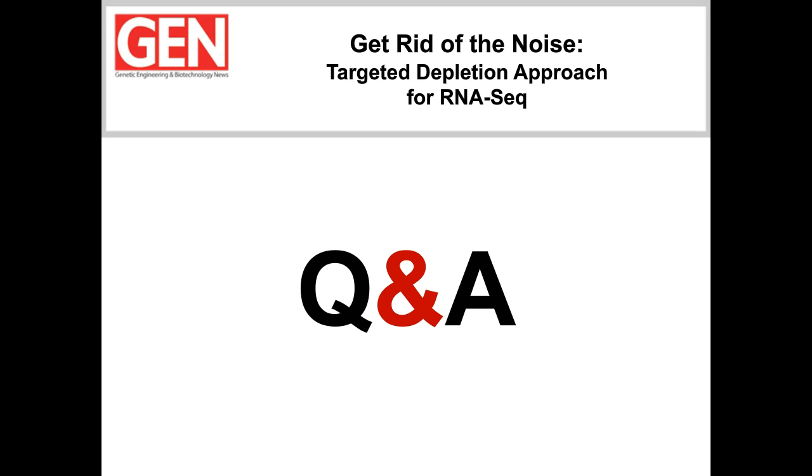A good question. So what we typically do here, and what we advise our customers to do, is first to run an Agilent Bioanalyzer High Sensitivity DNA chip to look at the trace, the size range of your libraries. If you're seeing a nice broad peak centered around 320-ish base pairs, again, as I mentioned earlier, that can fall slightly lower if you're using degraded RNA samples. But looking for typical library distribution around that size range is important. To quantify, we advise using KAPA real-time PCR to quantify the sequenceable library, the amount of sequenceable final library products in your product. So those are the two things we routinely do here.